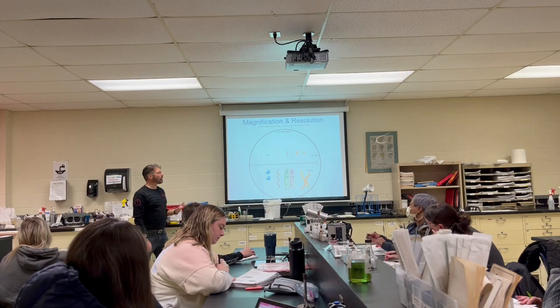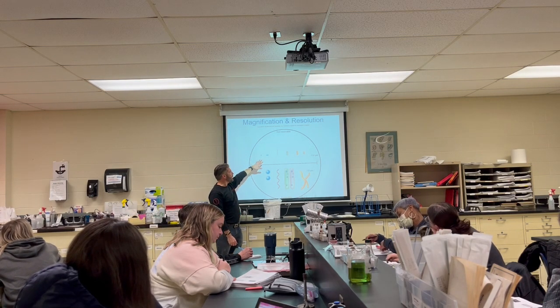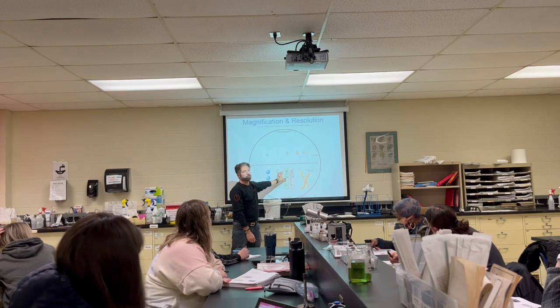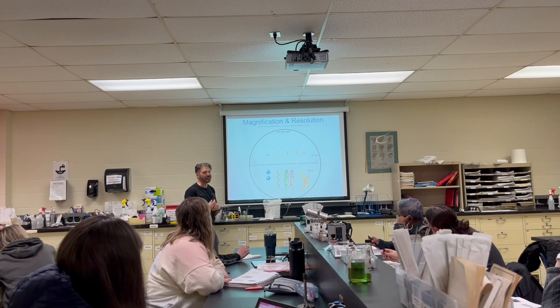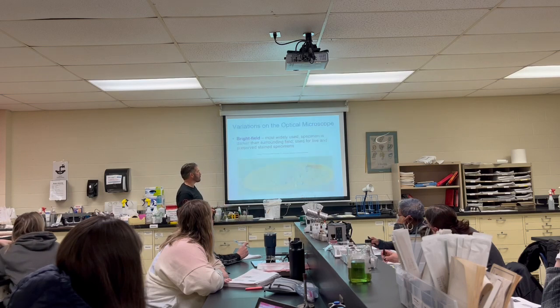So this is really telling you resolving power. And not a big deal, but if you look, these are a little bit harder to differentiate. With here, we can resolve these as two separate images. Right. Does anybody here have trouble night driving? A little bit more difficult? And then let's make it dim, and let's throw a little rain so the street's wet. All right, so your resolving power goes way down, so you have an idea of what I'm talking about.